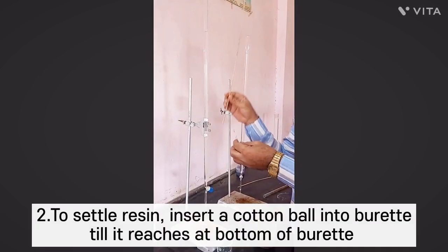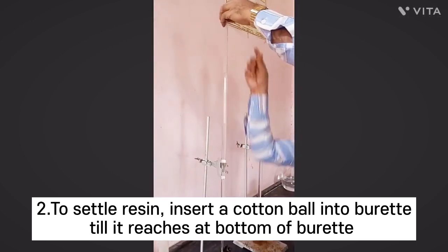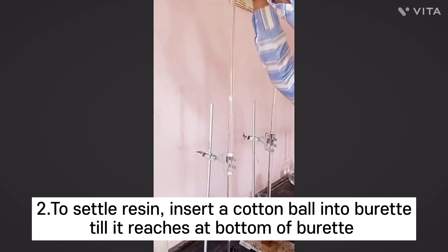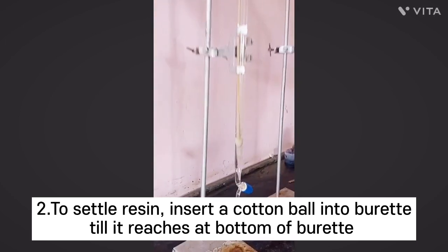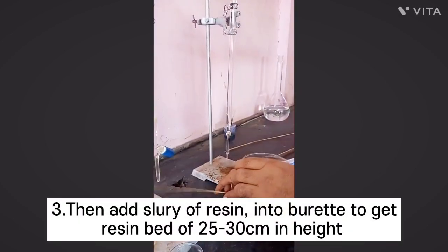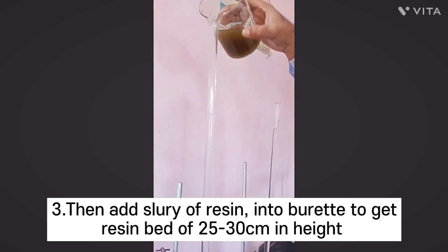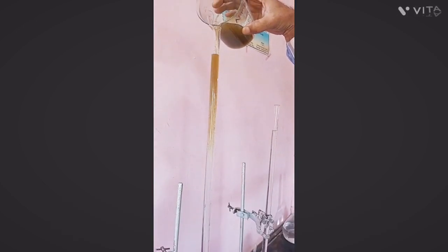To settle the resin in the burette, a cotton wad is inserted into the burette until it reaches the bottom of the burette. After which, the slurry of resin prepared is added into the burette to get a resin bed of 25 to 30 centimeter in height.